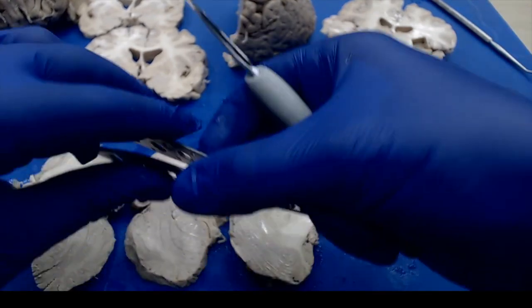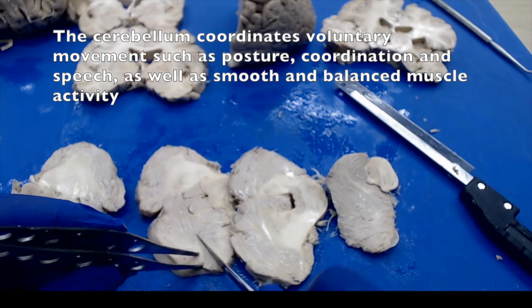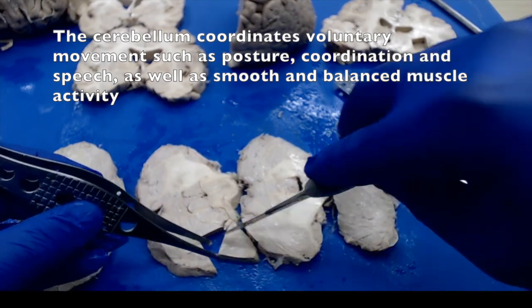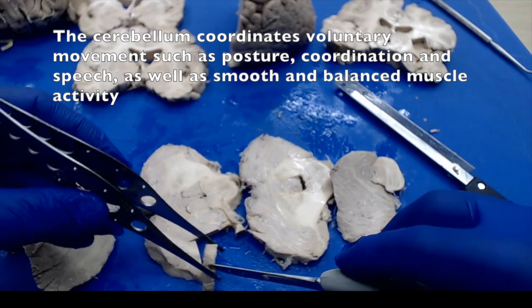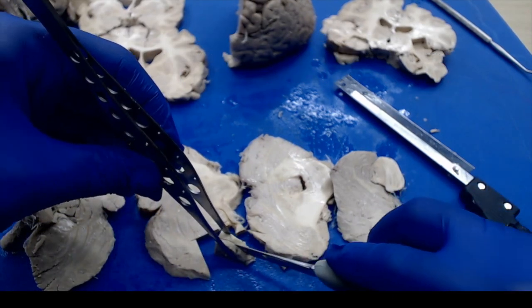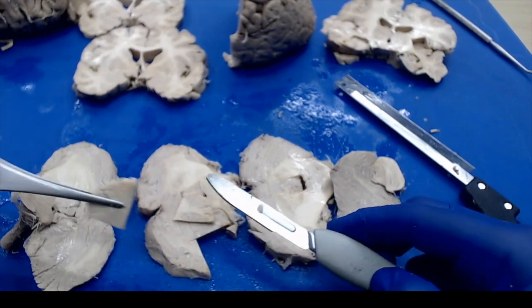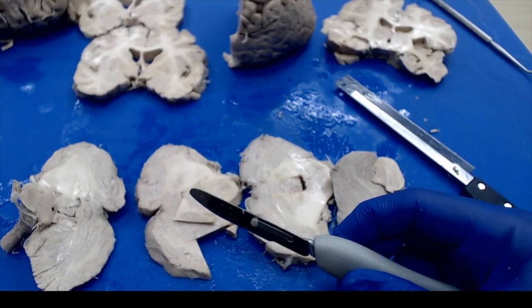So the cerebellum is a lot of our motor control in general. So if people demonstrate signs of ataxia, which is sort of issues with movement control, that could be a cerebellar issue. Sometimes you see that in infarcts. So we want to get a peripheral section of that, or if you see any infarcts, we'll grab sections from there as well. And so that's our 5 basic sections.